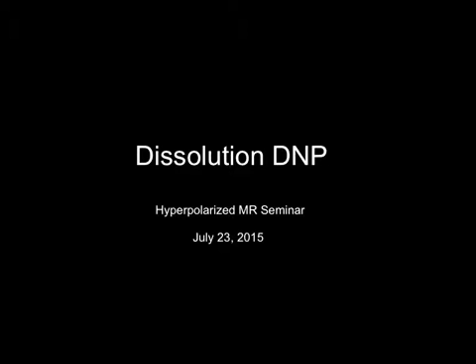Specifically, really on the Hypersense system is what I'm going to talk about, because that system is substantially easier to operate from start to finish, and that's probably the one that most of you will be using, at least for your initial work. As you know, this is a system that's designed for preclinical work only.